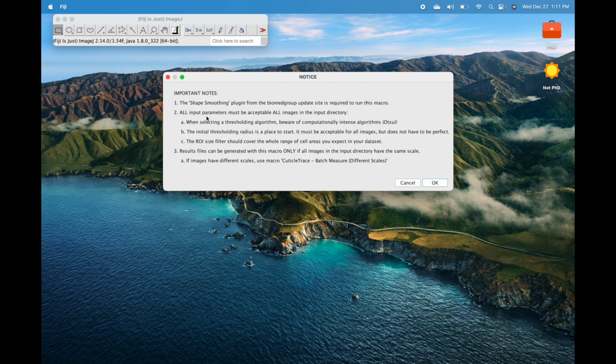But things need to be in the same general ballpark for you to be able to batch process images together. So if you try to batch process and a small subset of your images are just not working, I would recommend just pulling those off to the side and doing those separately, because you might be able to get them to work in their own little batch as opposed to in your larger batch of your main images. The result should still be an accurate tracing of these images, so they should be cross-compatible. Like, you should be able to compare them to one another easily.